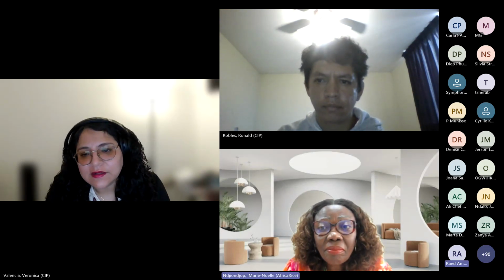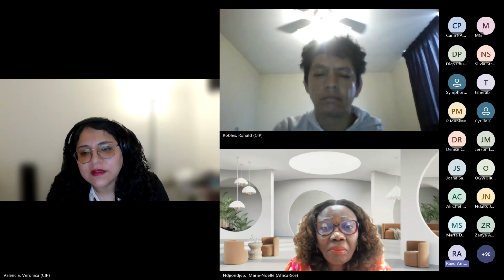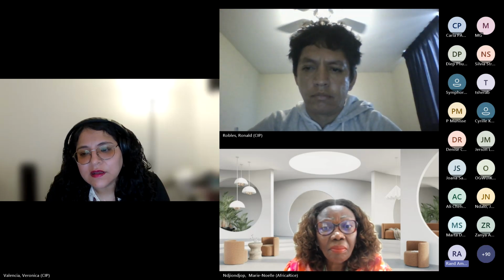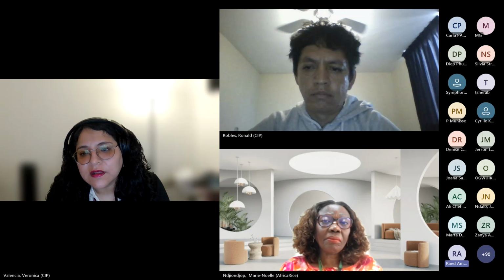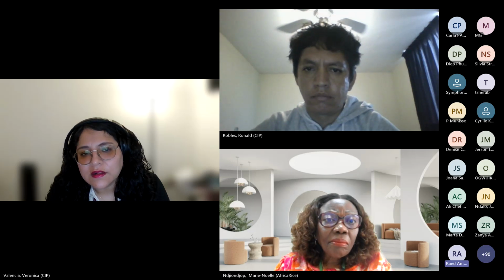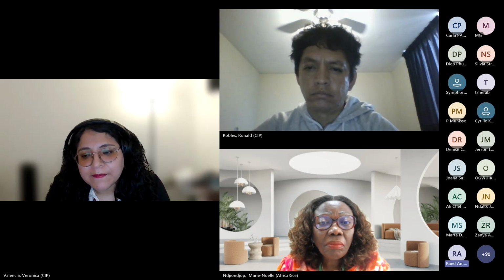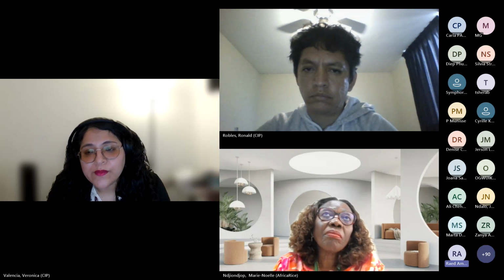My name is Ronald. I'm from Saudi Arabia. Also, I'm the focal point of Saudi Arabia with FAO. First of all, many thanks for organizing this workshop with the wonderful scientists. My question is for Blanca: what is the best approach to extract high quality RNA from old samples that were not properly preserved? I mean, is there any protocol you recommend for degraded materials? Thank you.